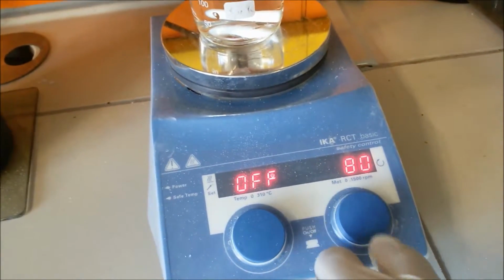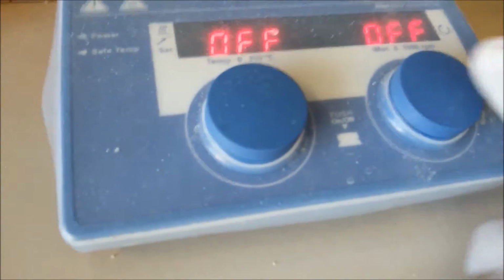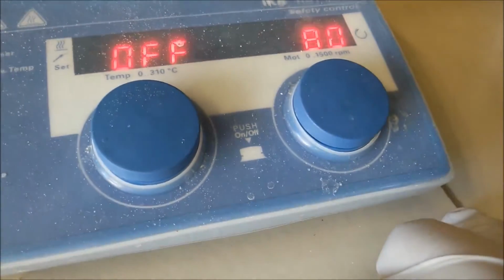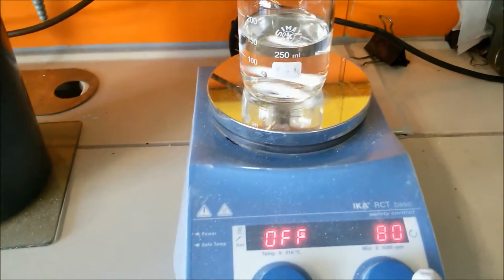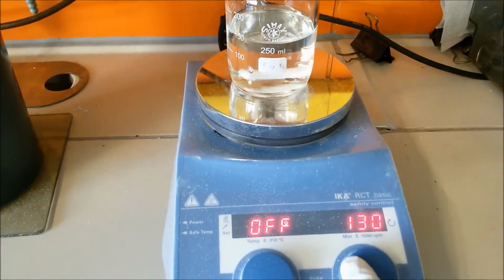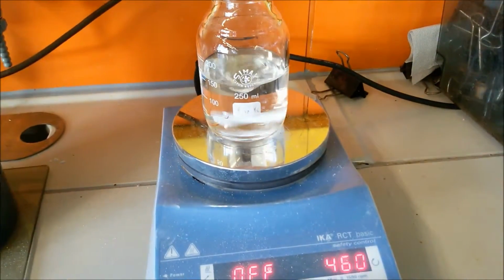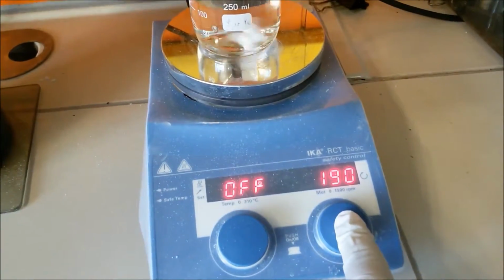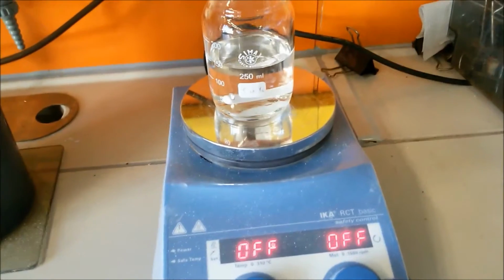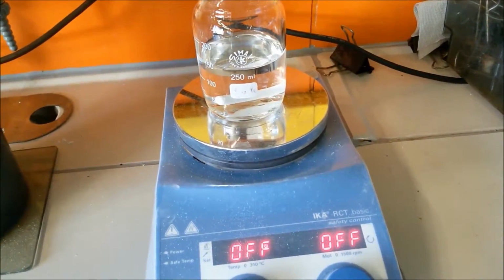Let's make it 100. And in this machine, you actually have to press it. So you press it, and you see that now it started rotating. Okay, now you can change it and it will rotate more. You can see it, and now it will dissolve the chemical. You can press again to stop it. It's off again. And that's how we mix anything we want to dissolve.